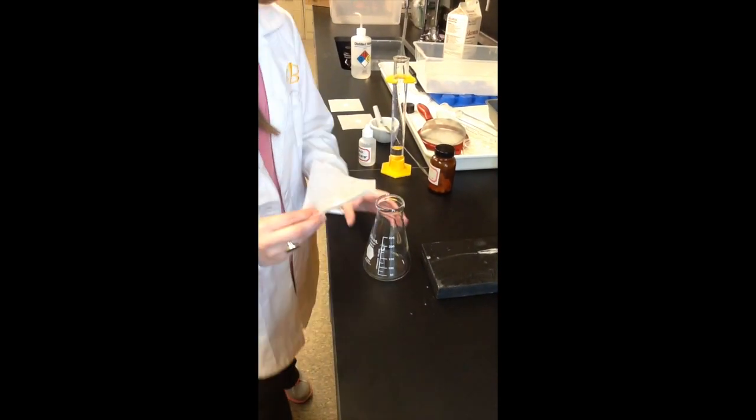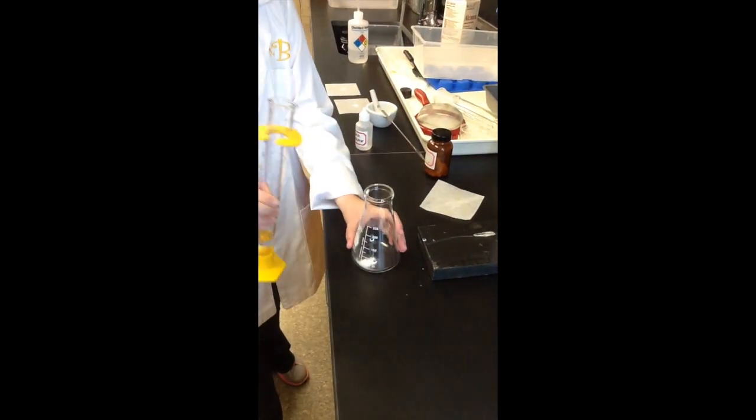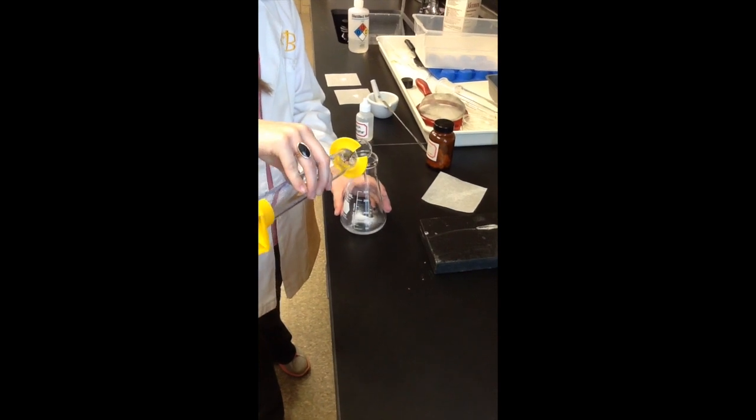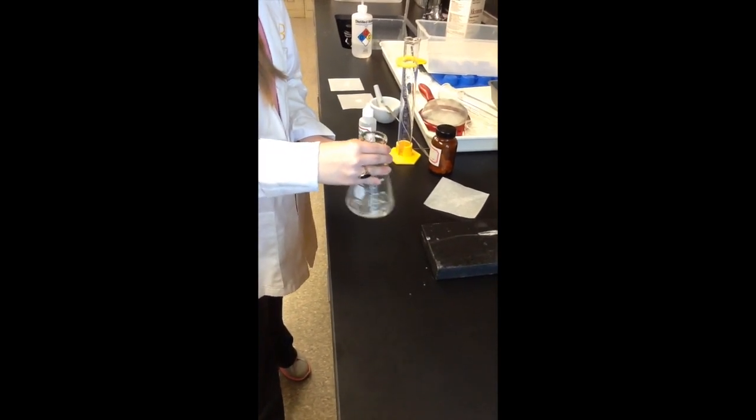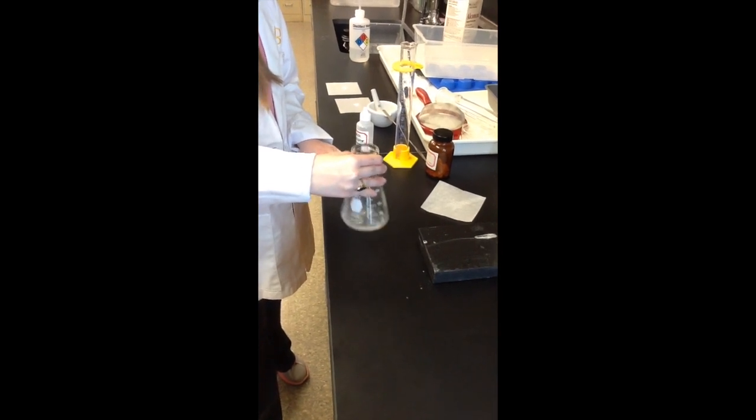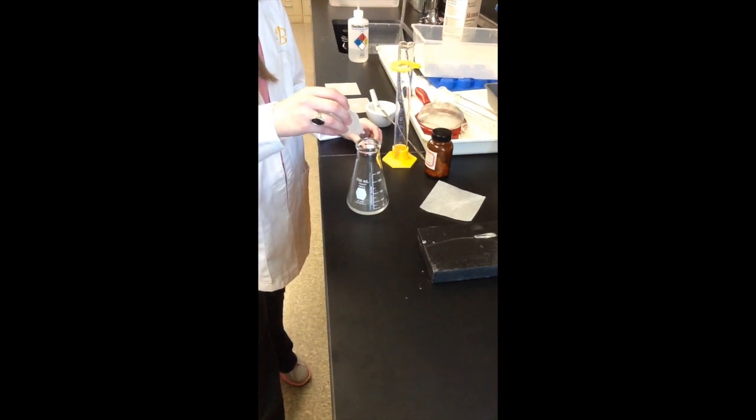Transfer the crushed tablet to a 250 mL Erlenmeyer flask. Add 25 mL of DI water and about seven drops of the starch indicator. Swirl to dissolve the crushed tablet. There may be some powder that does not completely dissolve, but this will not affect your results.